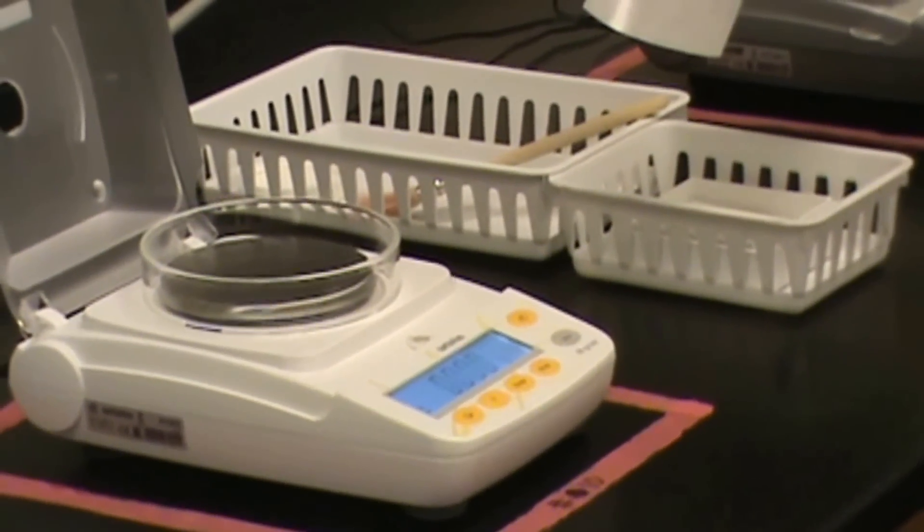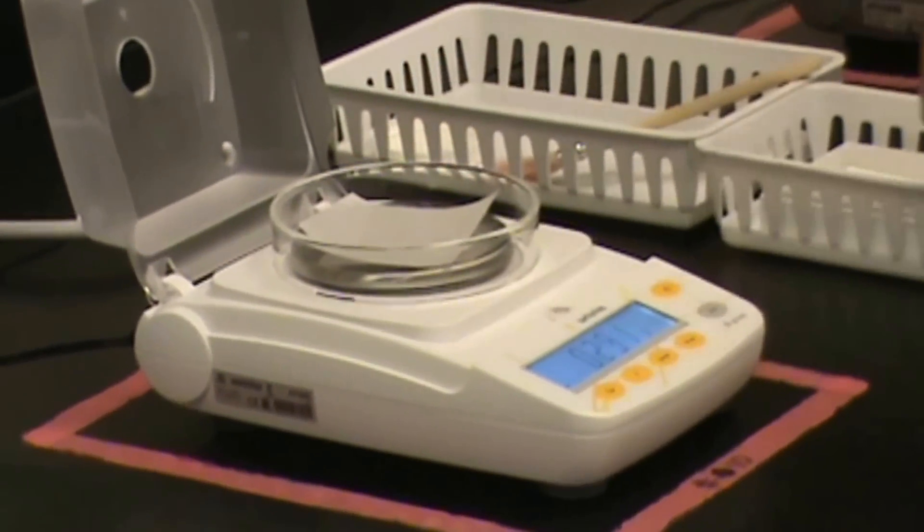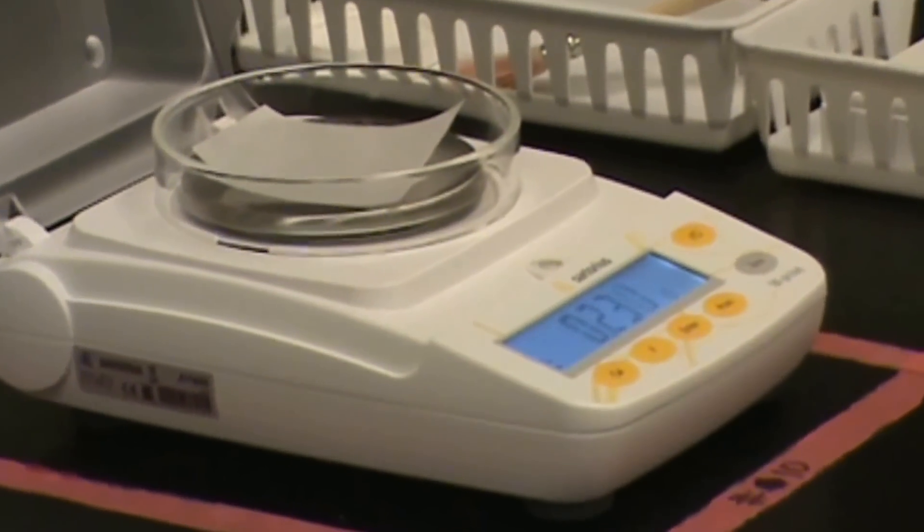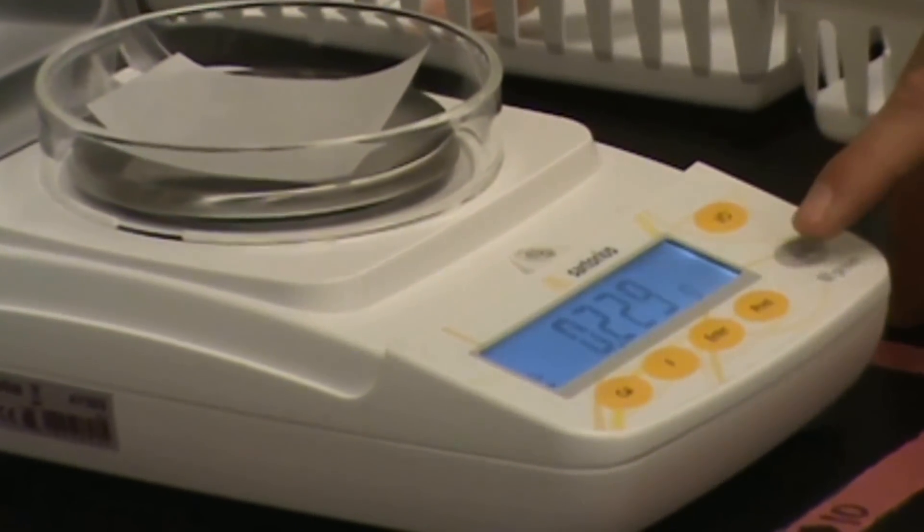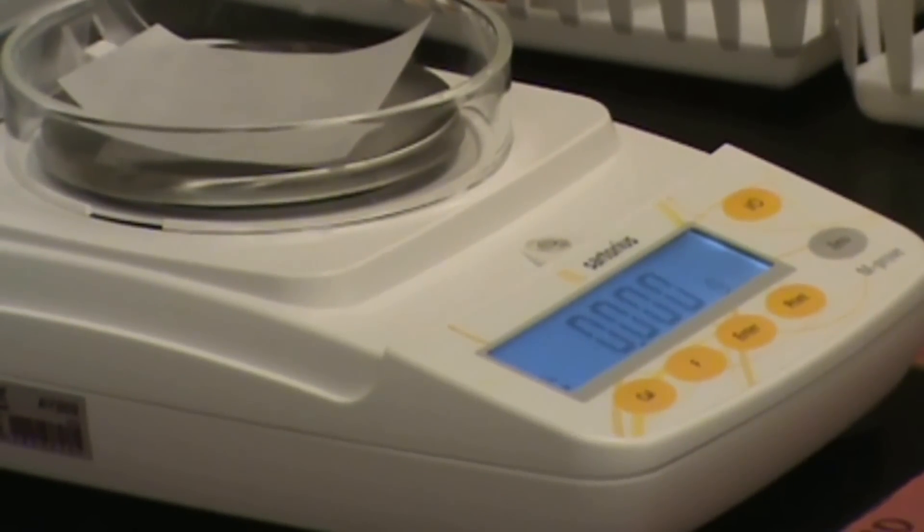Adjacent to the balances, you will find these weighing papers. You place them on the pan in order to protect the pan from the chemicals. At this point, you will probably want to hit the zero or tare button in order to re-zero the mass. The balance will automatically subtract out the mass of the weighing paper.